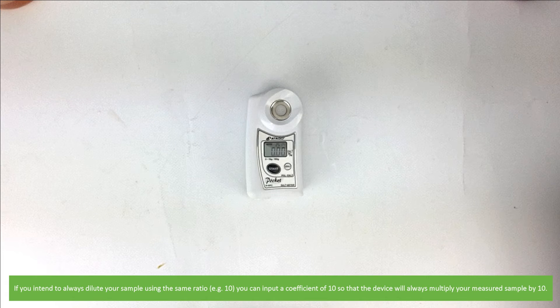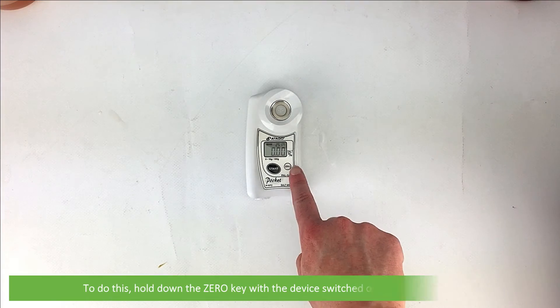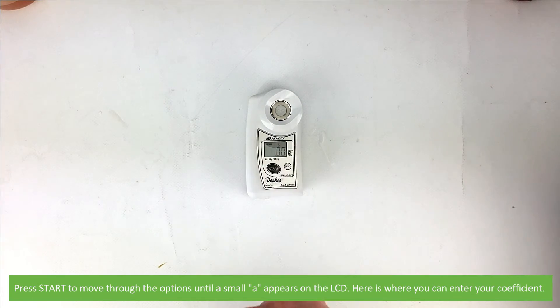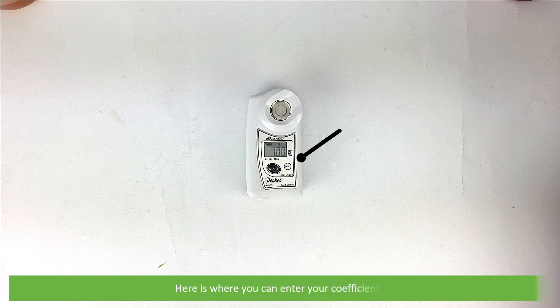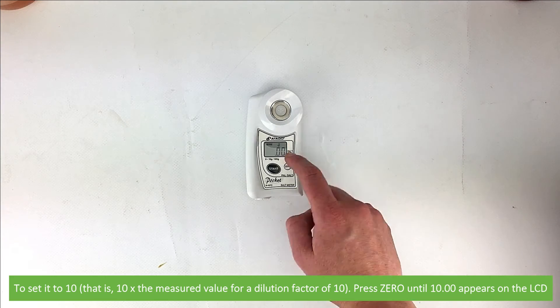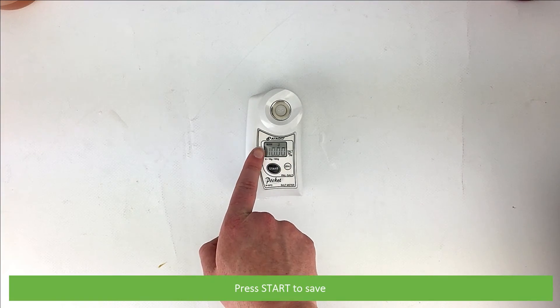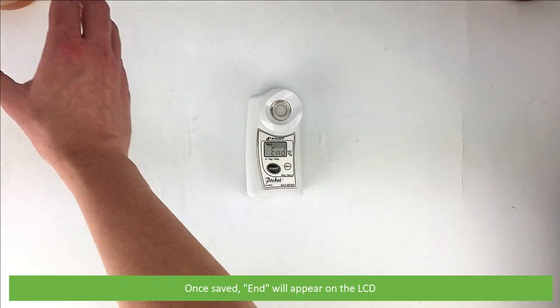If you intend to always dilute your sample using the same ratio, you can input a coefficient of 10 so that the device will always multiply your measured sample by 10. To do this, hold down the zero key with the device switched on for about 5 seconds. A small 'b' will appear on the LCD. Press start to move through the options until the small 'a' appears on the LCD — here is where you can enter your coefficient. To set it to 10, press zero until 10 appears on the LCD, then press start to save. All the digits will flash to confirm the set coefficient. Once saved, 'END' will appear on the LCD.